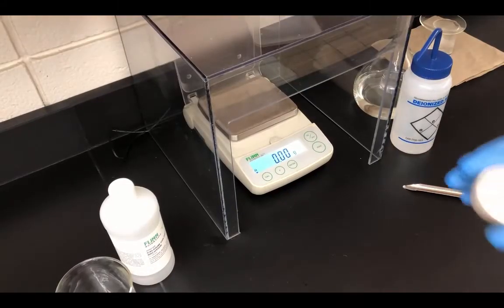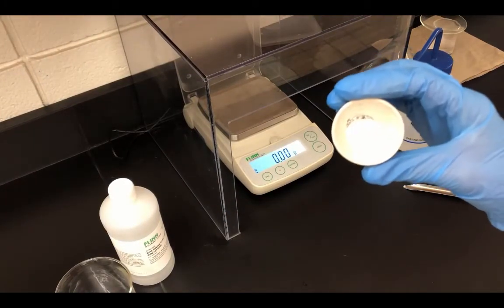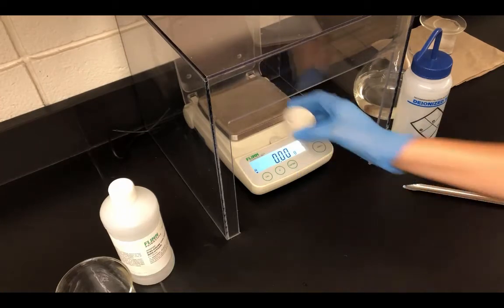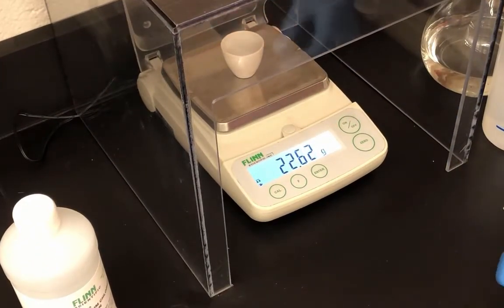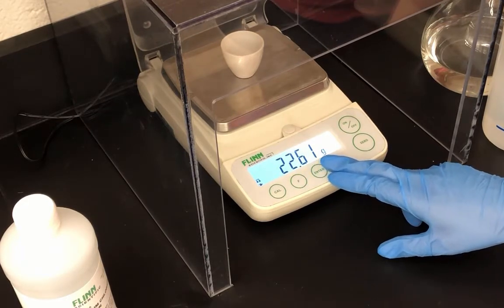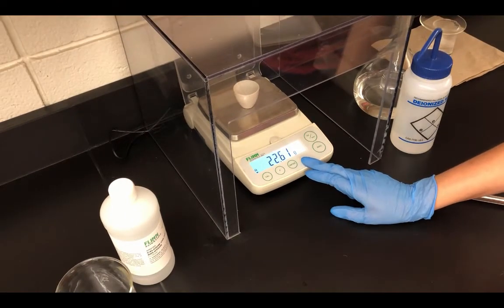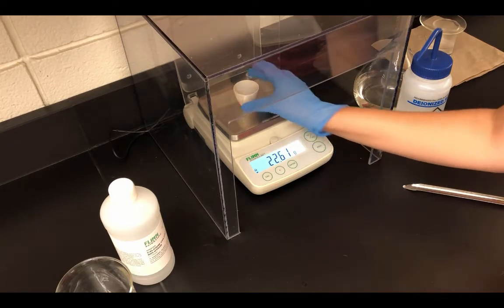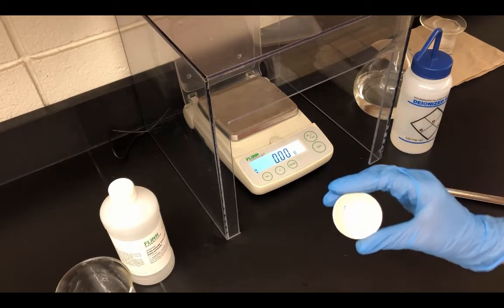So once again, the crucible is cool to the touch. We have the unknown group 1 metal carbonate. I'm going to go ahead and put it on the scale. And it reads 22.61 grams. So after our third heating, 22.61 grams. So since the mass stayed the same, we are now ready to move on to the next step in the procedure.